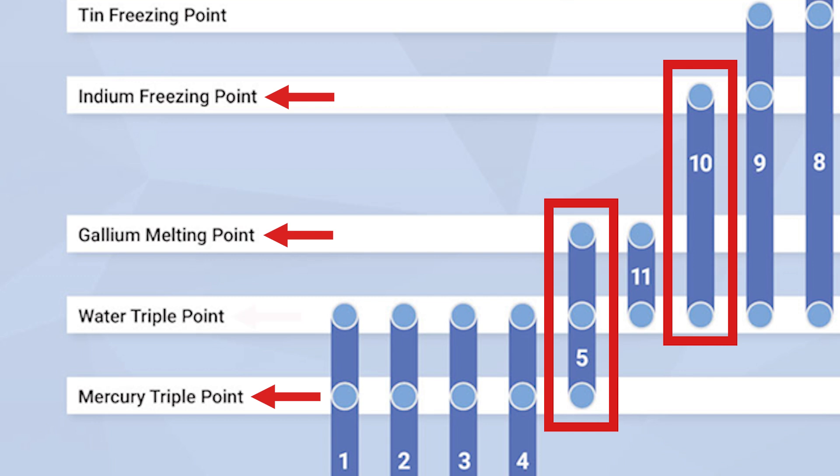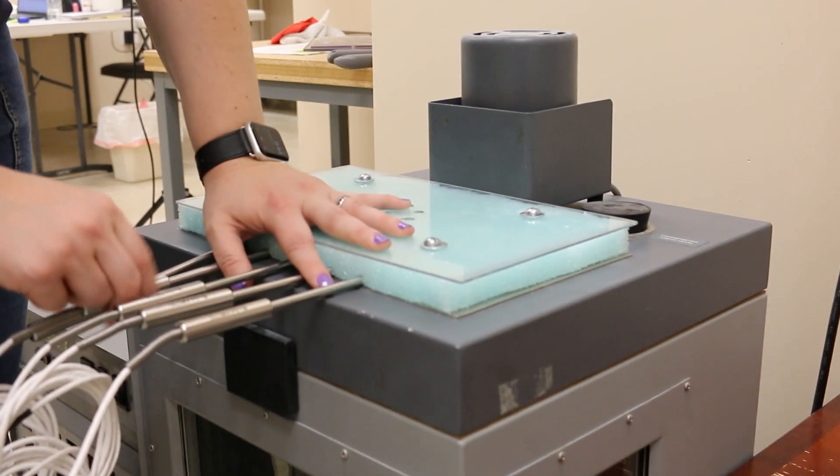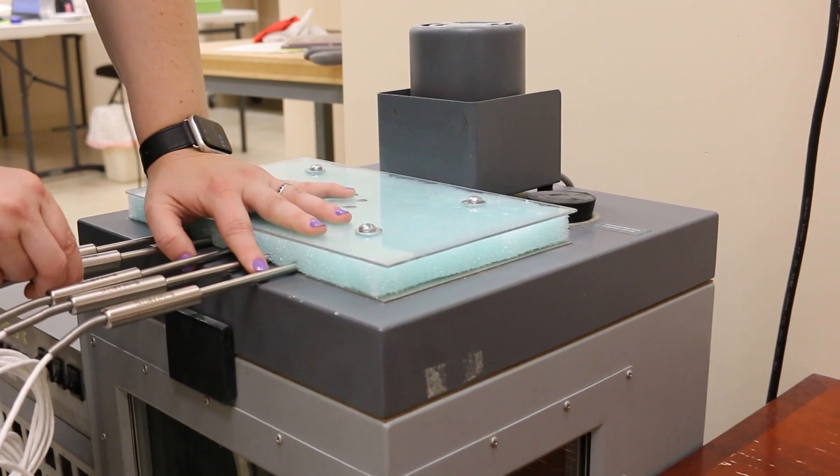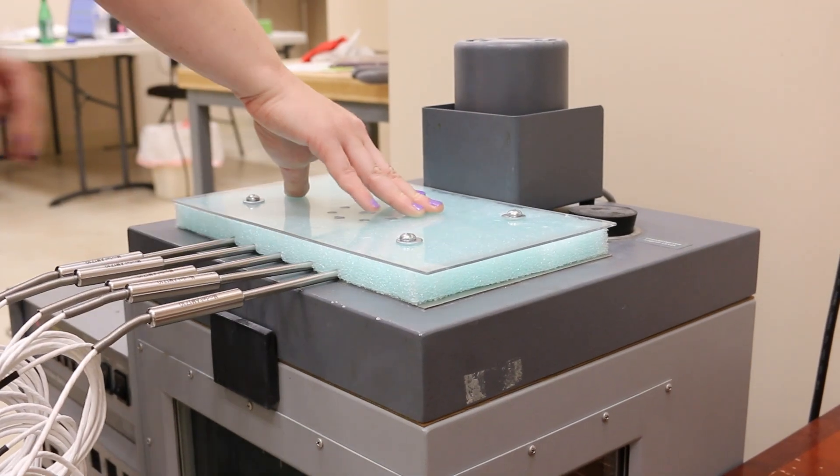With exception to the triple point of water, all of these points will be measured with a comparison calibration. Comparison calibrations are used to test probes across ITS-90 subranges without having to realize intrinsic standard points, which often require expensive equipment.